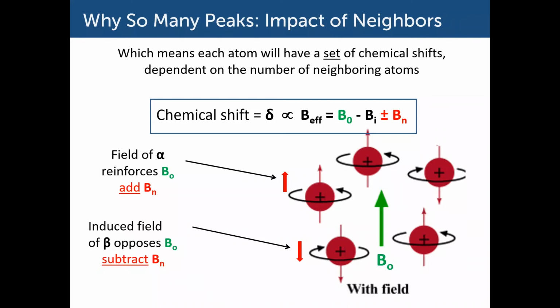We have essentially the localization of the cluster of lines being dictated by B sub I, the electron density, and then the so-called splitting of that signal, so basically getting these fine lines that are all clustered together, that comes from B sub n.